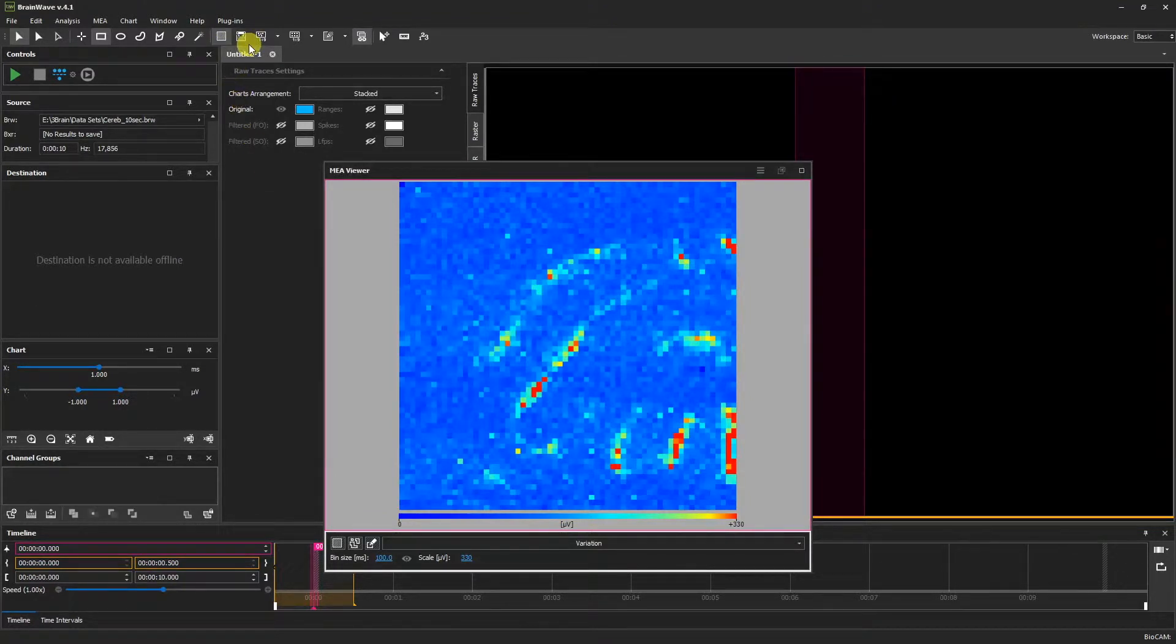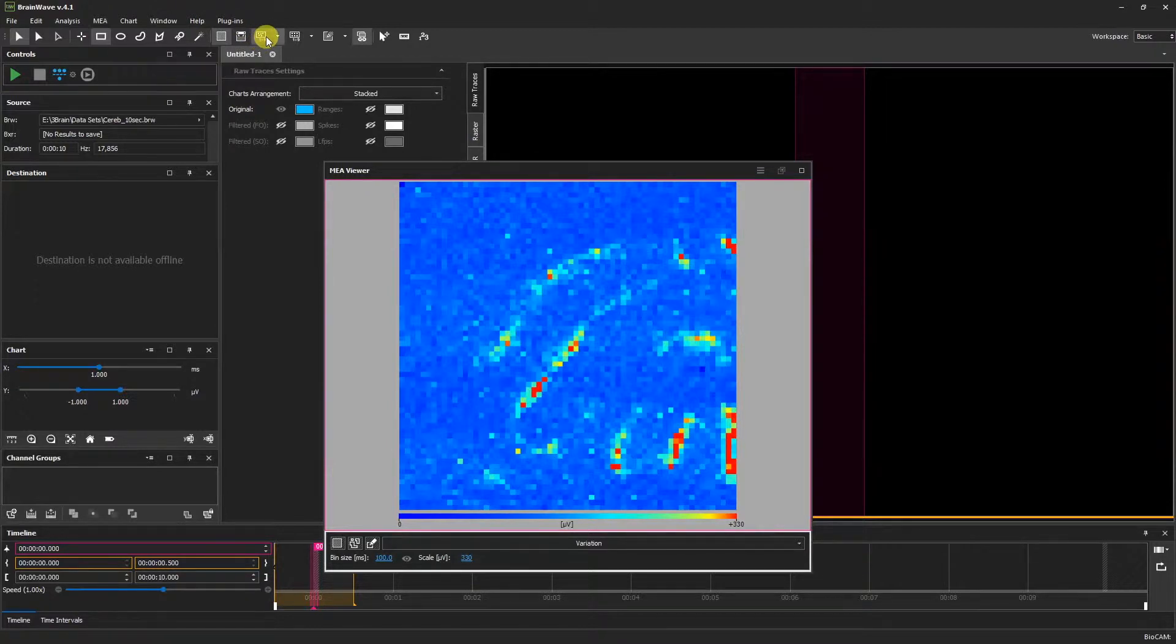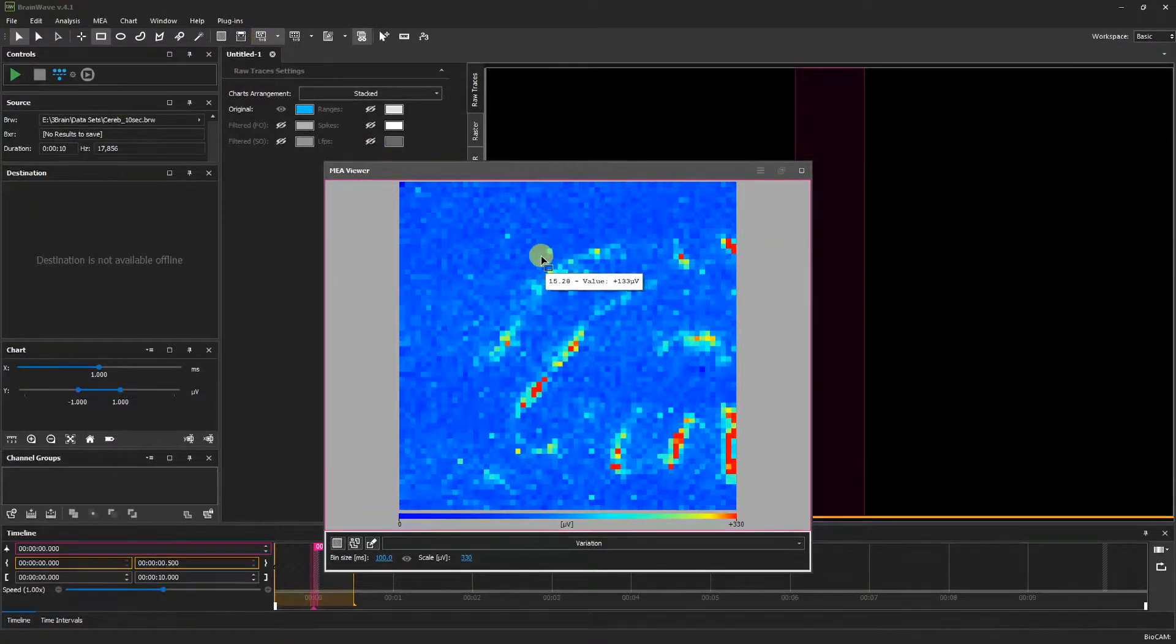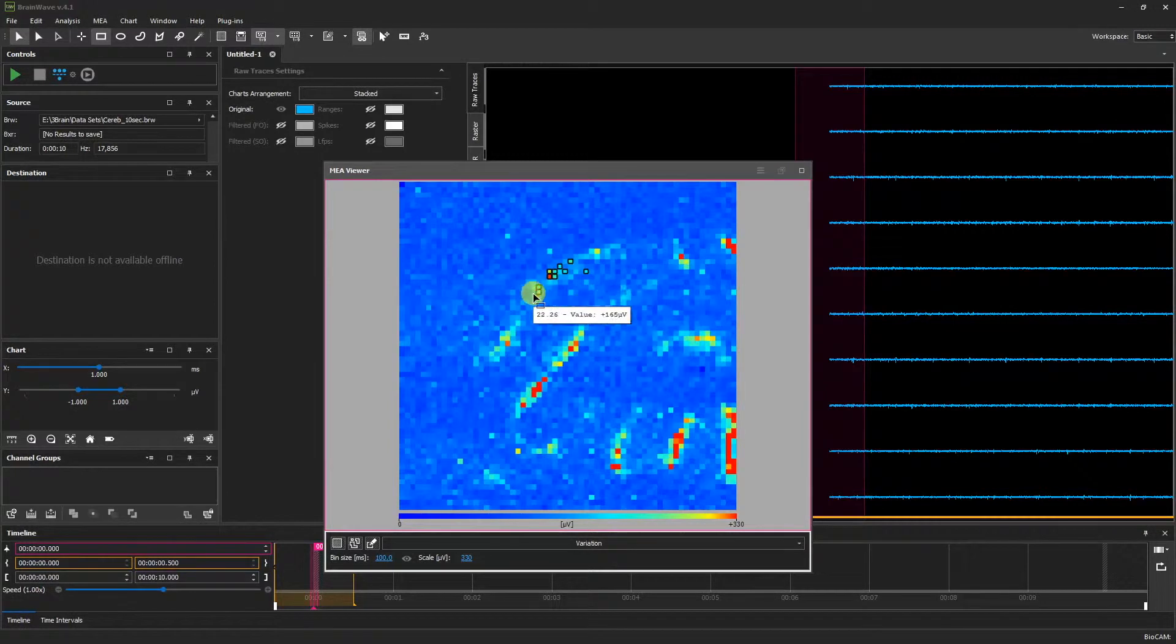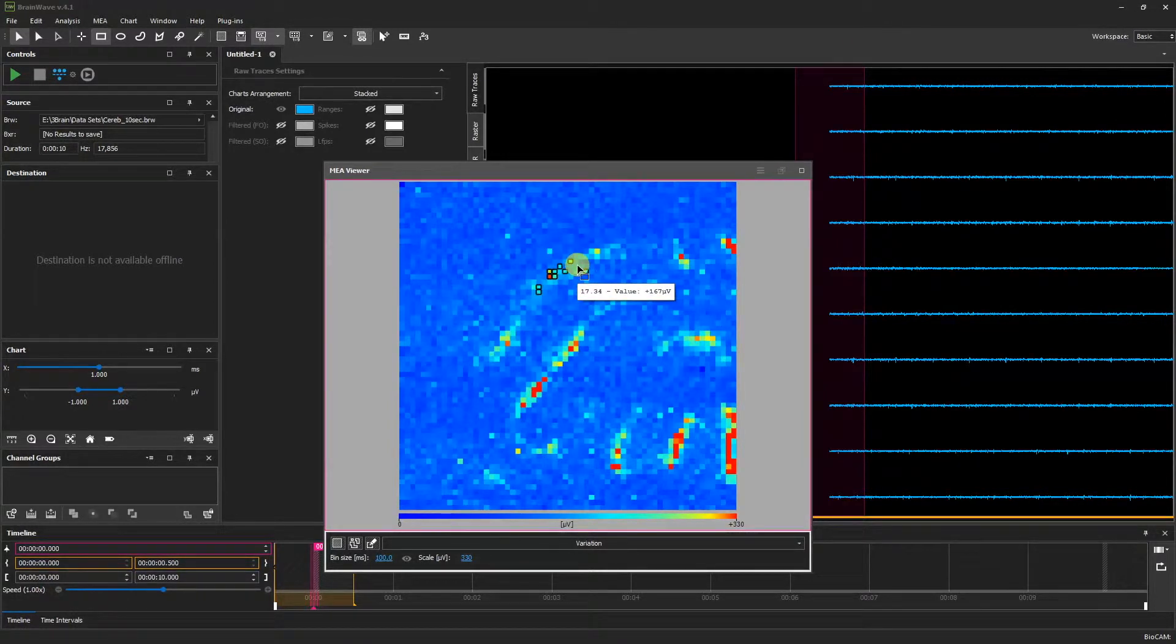We can also modify the modes by clicking select most active channels in a region. Then when we make our selection, only the most active channels within this area will be selected.